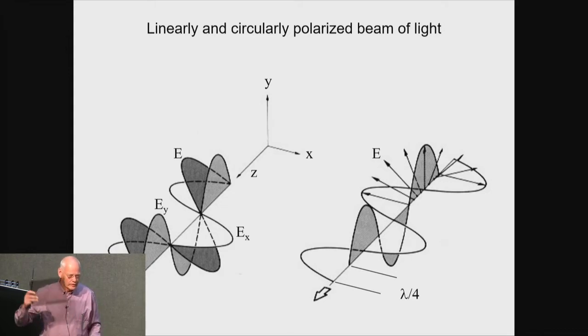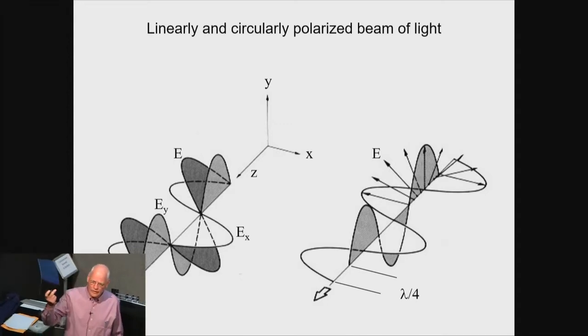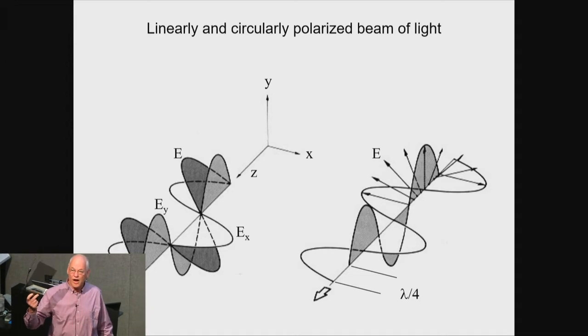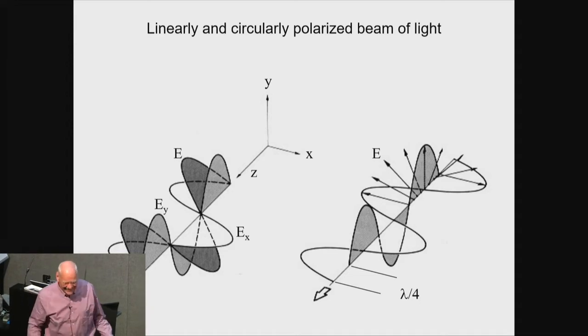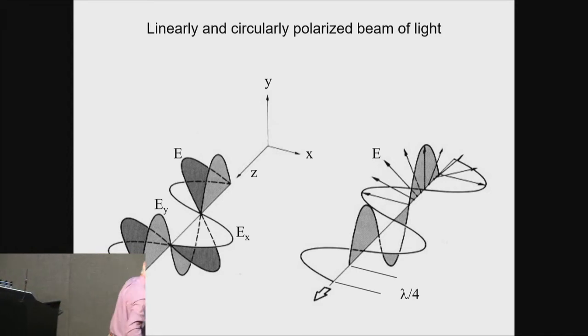So you have linearly polarized light that comes through this filter perpendicular to the needle axis of the iodine crystals. And then you can have a second one, and you can buy these at polarization.com. You can buy these filters, and you can align them parallel. Wow, I can even do this here, maybe.